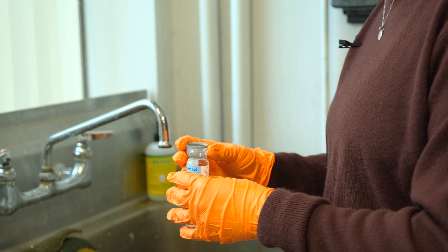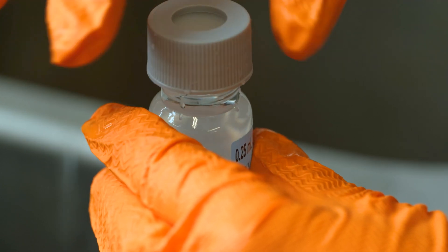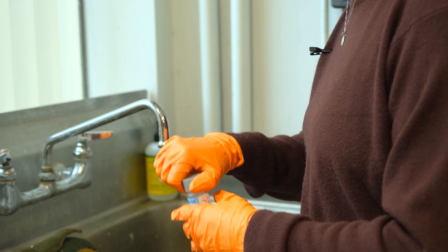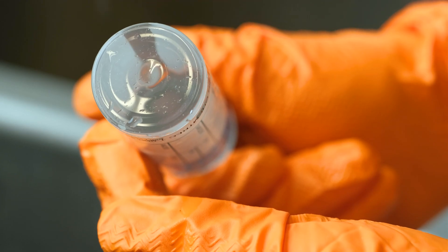To close the vial, take the cap, flip it over, and slowly turn the top. Check the top for any bubbles to make sure there's no airspace in the vial, then flip it over, tap it on your hand a couple of times, and check the bottom of the vial to make sure there are really no bubbles.